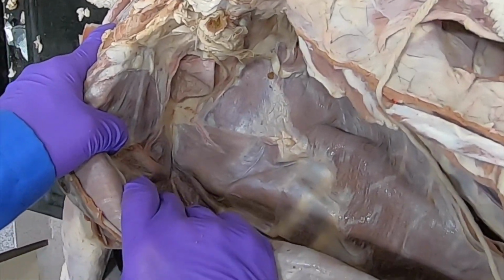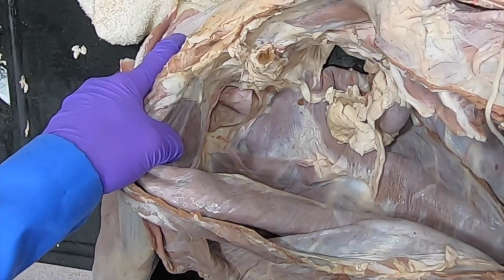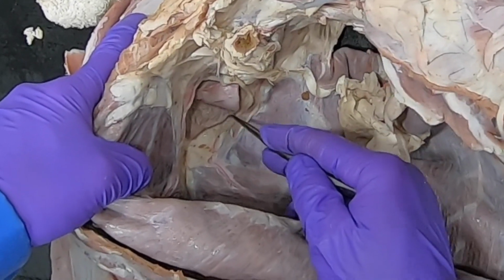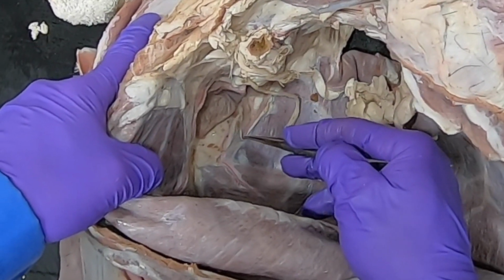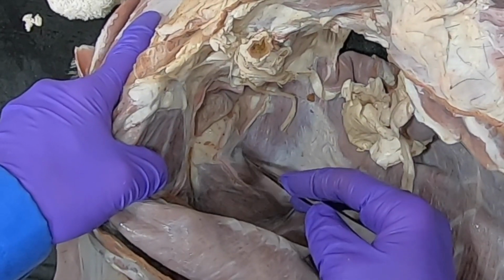So if we come back in and we look in this way, we can see here the testicular vessels coming down, and it's joining with the ductus deferens right here, and it's going in through the vaginal ring into the deep inguinal ring.